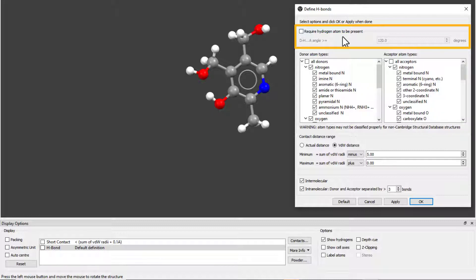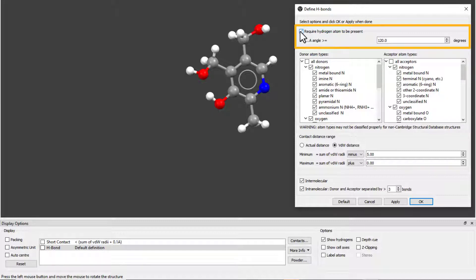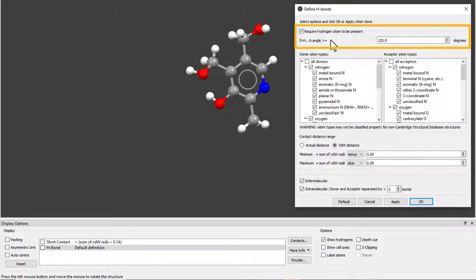This is particularly useful if H atoms have not been located in the structure you are analyzing, as the hydrogen bonds will be displayed anyway. If we tick the box, we see that now we could also change the donor hydrogen acceptor angle threshold value.